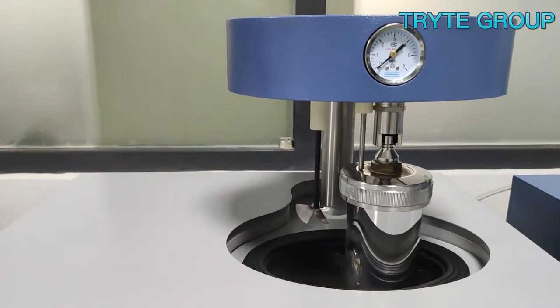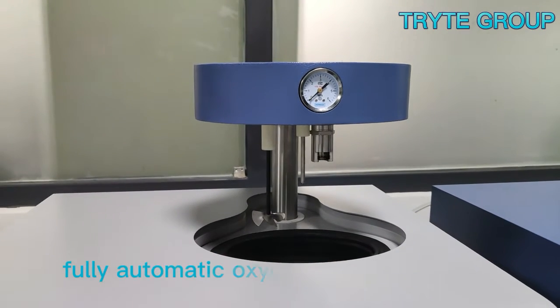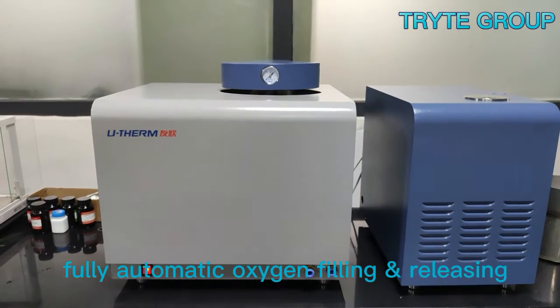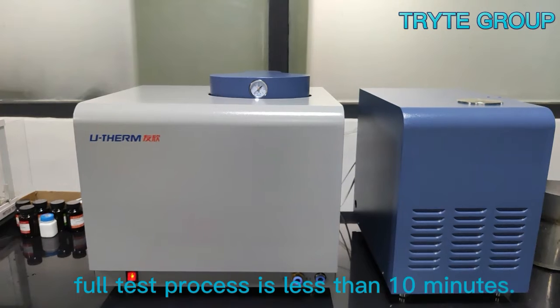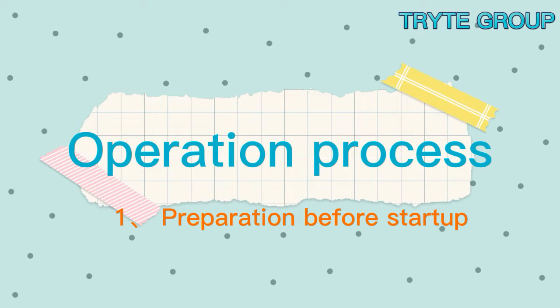Automated design: fully automatic oxygen filling and releasing, fully automatic bomb raising and lowering. The full test process takes less than 10 minutes.